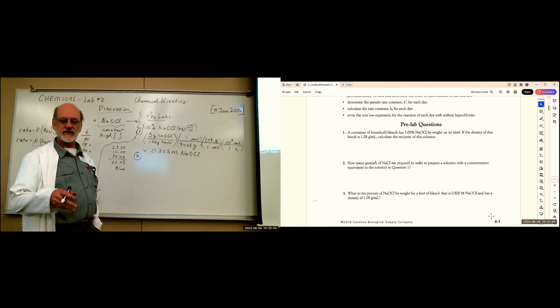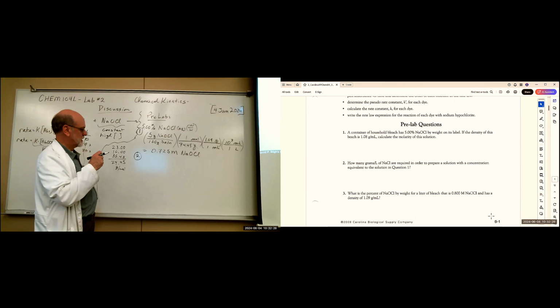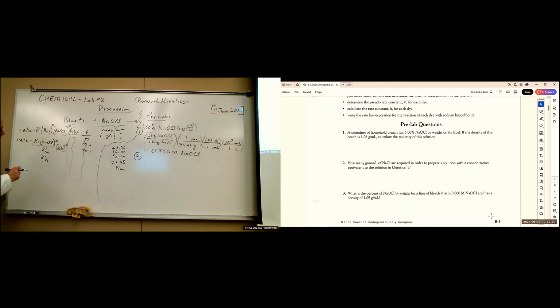But we can't just dilute the bleach with water, because there are other factors involved when the bleach gets to acting on things. What we want is something that has the same ionic strength in solution as sodium hypochlorite, but without the bleaching effect. So if we just take the oxygen out and do sodium chloride at the same molar concentration, then that's our diluent.